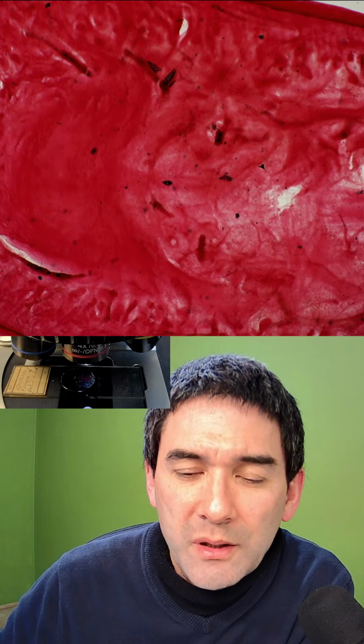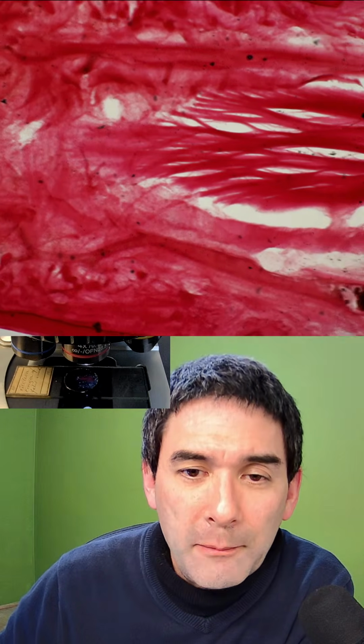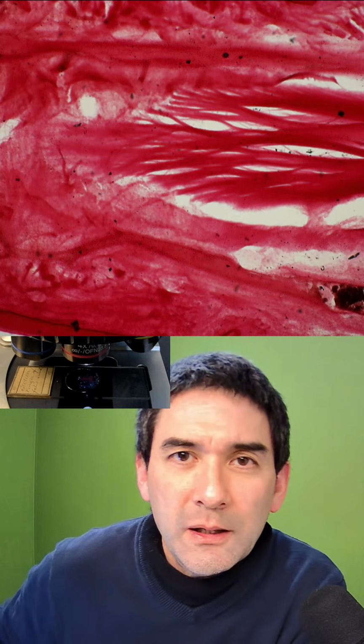Did the maker of the monkey tail slide mention the preservation method? No. But at that time, people used Canada balsam a lot as a mounting medium. So I suppose that it was also used.